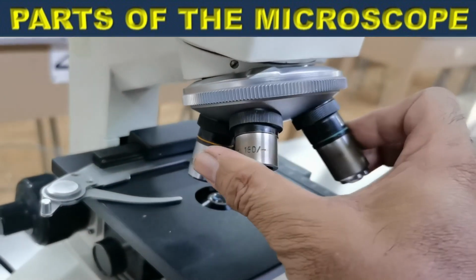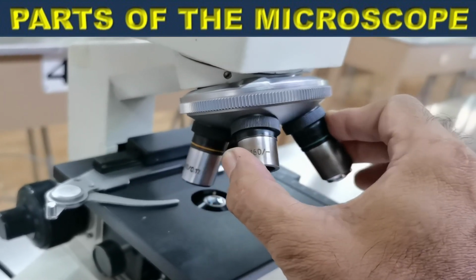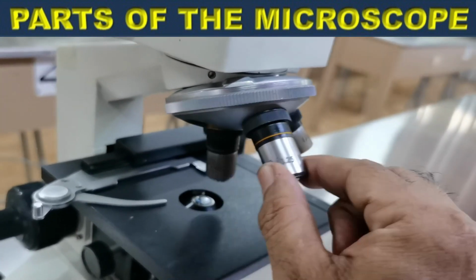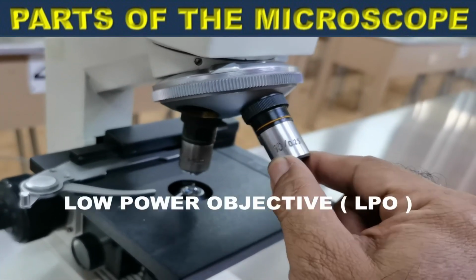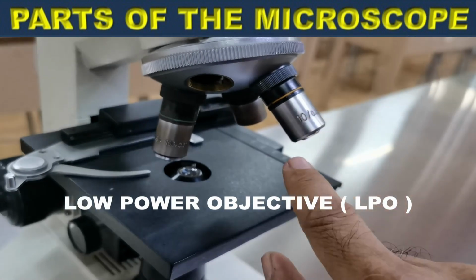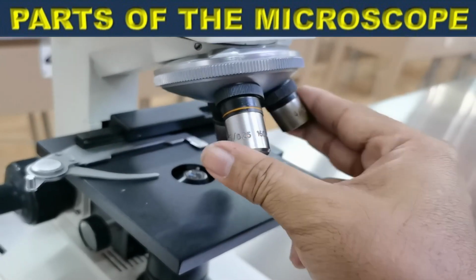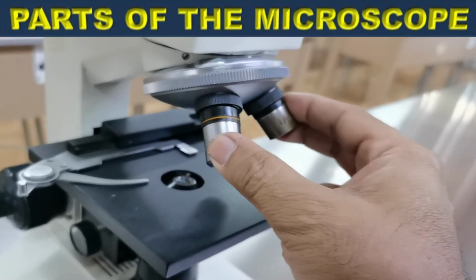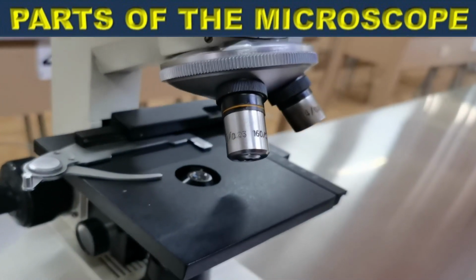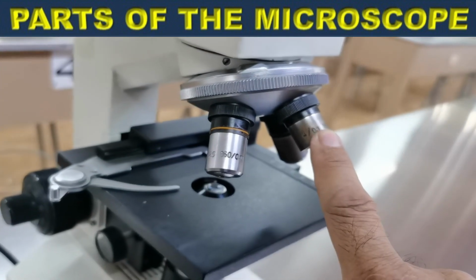Then, if you want to magnify the image further, we can shift to this lens. This is the low power objective. Usually the low power objective is marked 10x. So the low power objective gives you a higher magnification in comparison to the scanning lens.